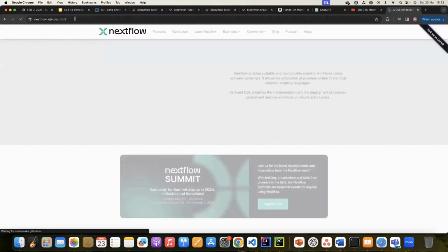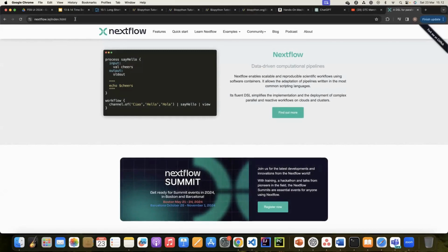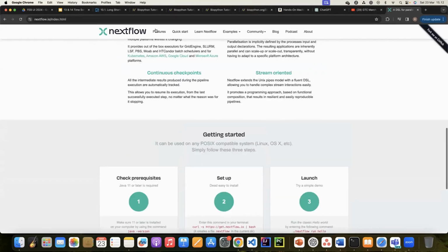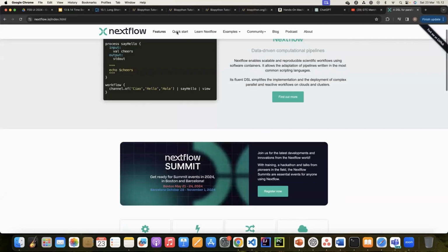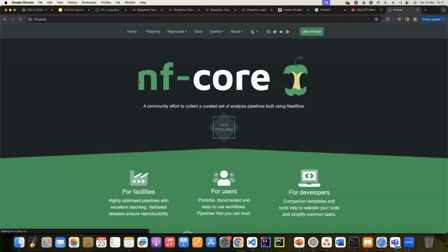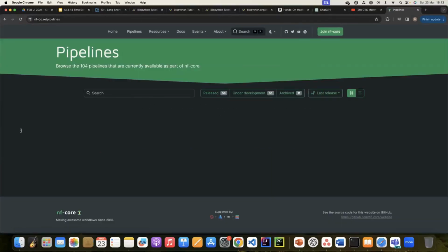Nextflow is another workflow engine that is also very famous currently, very active. Usually in Spain, in Barcelona, in the US, in Europe, they have many communities. And hopefully we can also create a Nextflow community in Indonesia. So researchers all around the world are contributing to Nextflow workflows. They publish the workflows in nf-core, NF referring to Nextflow, and they have many pipelines available.